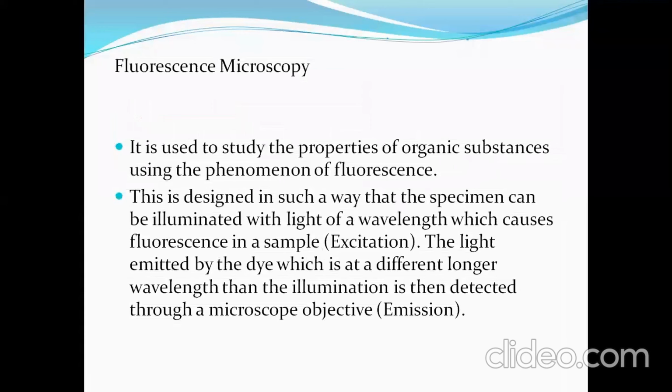So today I will discuss up to fluorescence microscopy: the principles, the construction of fluorescence microscopy, and the application part of fluorescence, as well as the phase contrast. The other two, electron microscopes, I will discuss tomorrow. So I have just designed it that way.